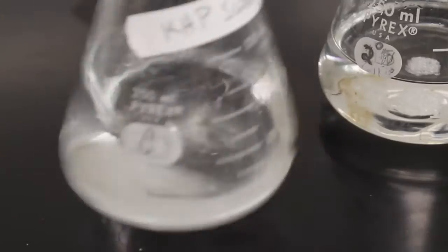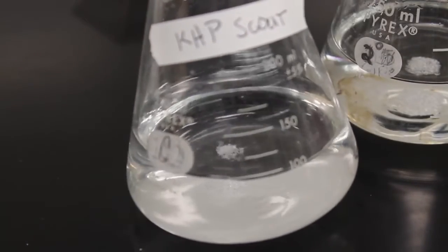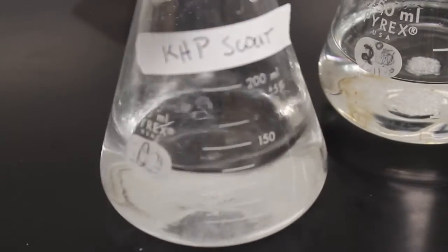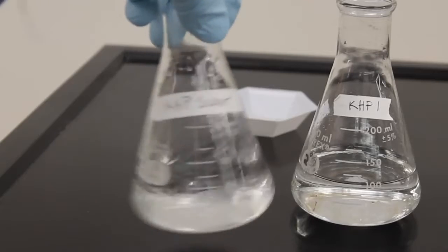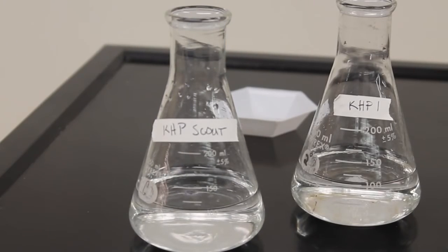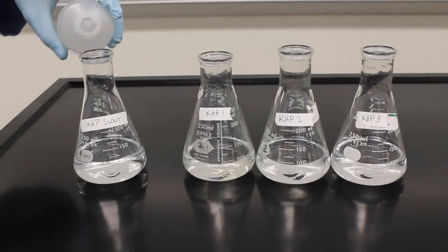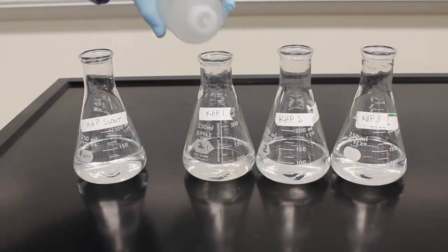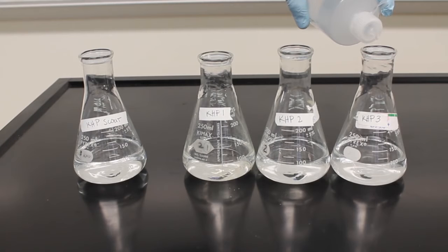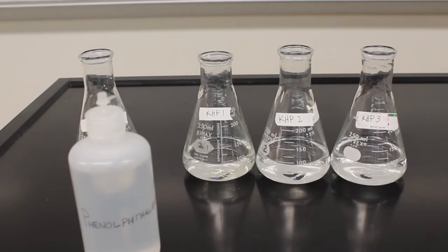KHP may take a while to dissolve, but it is important to make sure it is fully dissolved before you start your titrations. Here I am doing 4 titrations. The first one is known as a scout titration. More on this in a bit. Next, add a few drops of phenolphthalein. 2 or 3 drops per flask will be sufficient. Now we are completely ready to start our titrations.